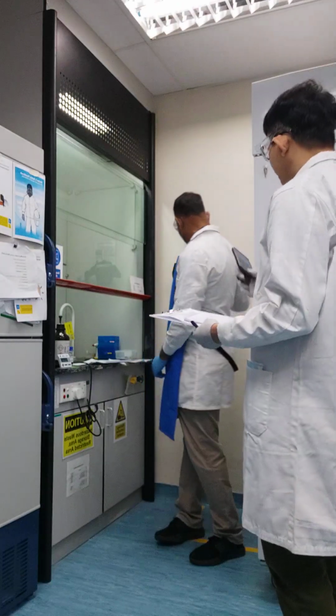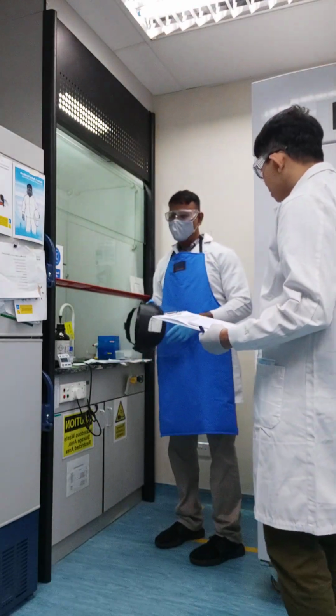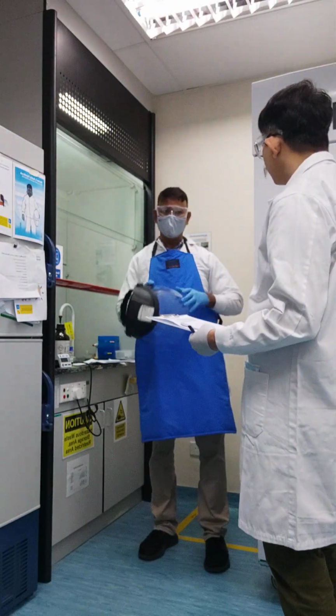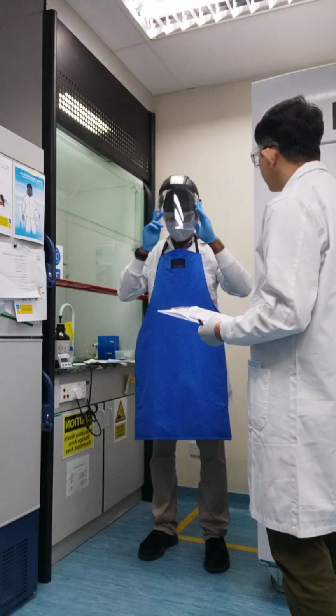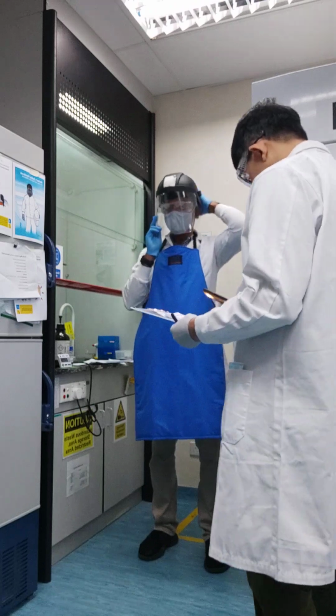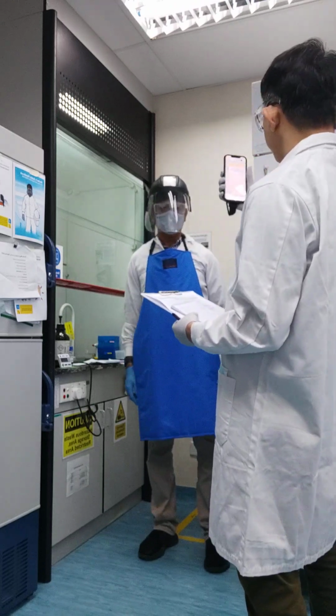And then the next step is to also make sure you protect your eyes and face from any inadvertent splashes or reactions. So you wear this chemical face shield.